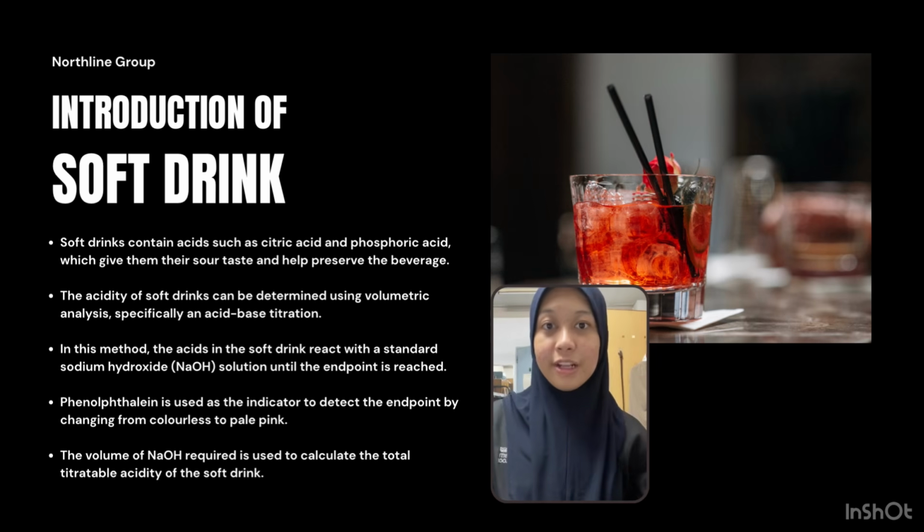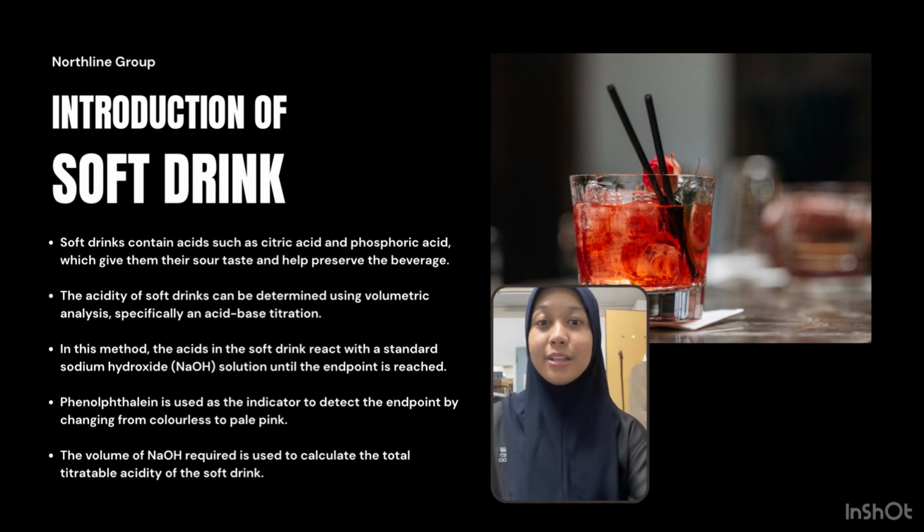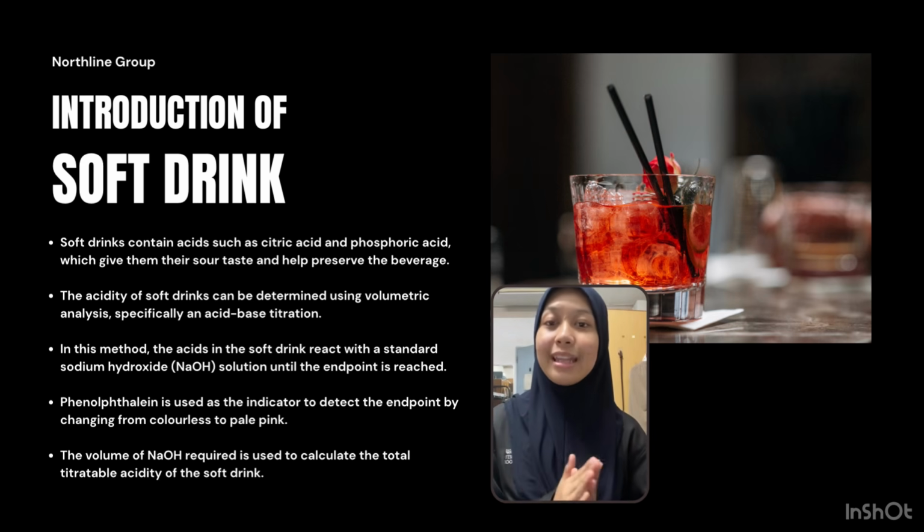Have you ever wondered why soft drinks taste sour? That sour taste comes from acids such as citric acid or phosphoric acid. Today, I will show you how we can measure that acidity using a simple technique called volumetric analysis.